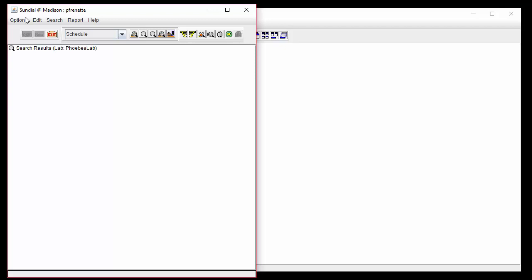This lab resource is maintained by the lab master or by a lab member who has been given permissions through the CAN-DO lab resource. To learn more about the CAN-DO tool and resource values, see our videos and help pages.